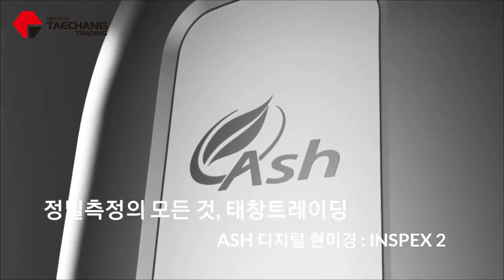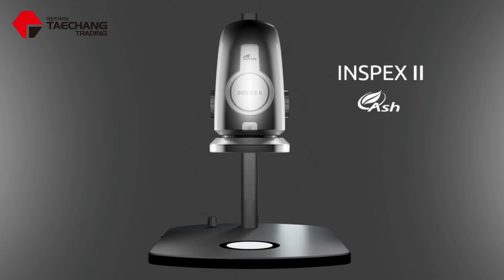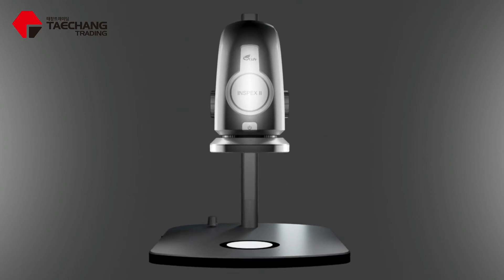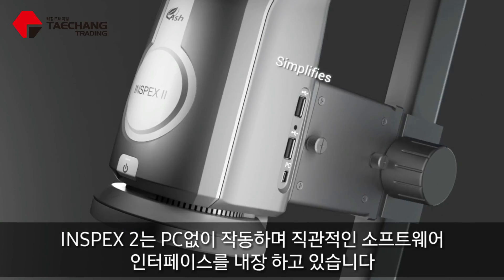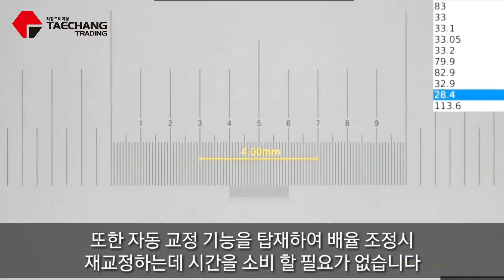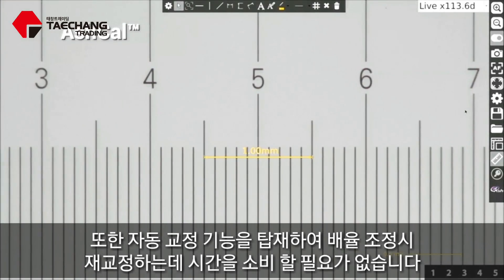Inspiration comes from clarity. The Inspects 2 from ASH Technologies is an ergonomic, fully integrated standalone system with no PC required. It has an intuitive software interface that simplifies operation and control. The ASH Cal auto-calibration feature removes the need for time-consuming zoom-change recalibrations, increasing productivity and efficiency.